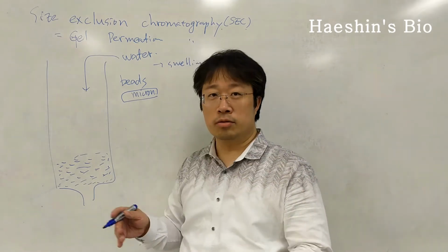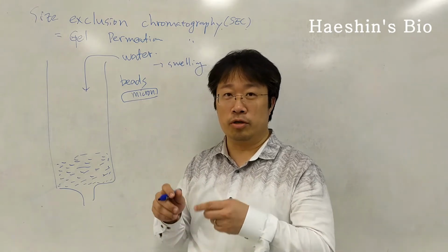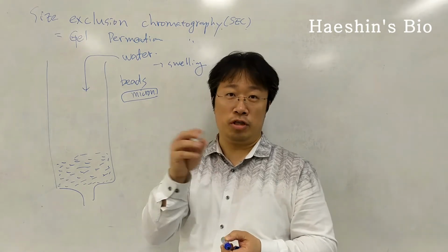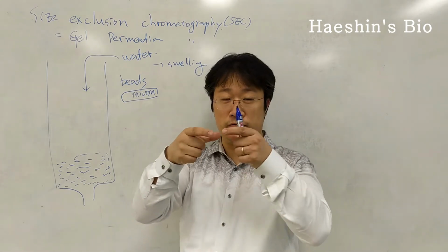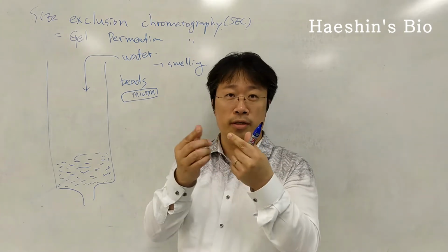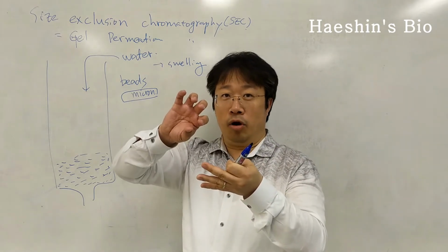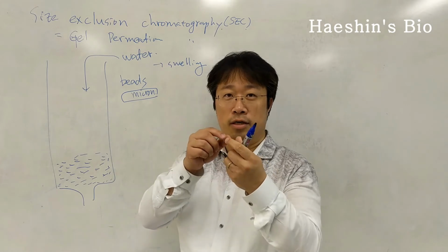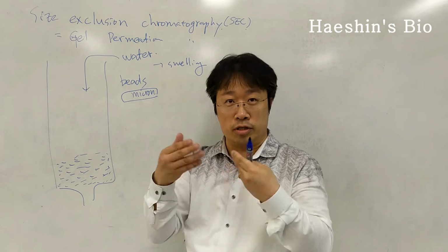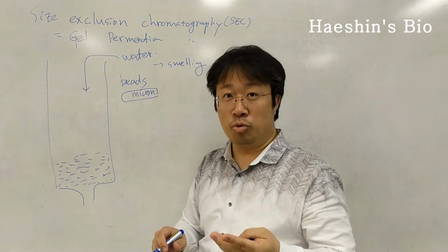The swelling process. Imagine you eat rice, for example, and the rice is dried out, so the volume is shrunk compared to the initial state. When it is dried out, without water, the overall volume shrinks, right? But if you add water back, then these dried rice particles swell. It's called the swelling process, and it becomes much bigger than the original size.